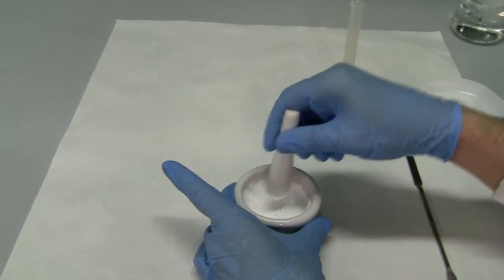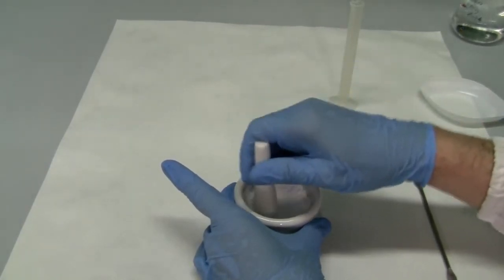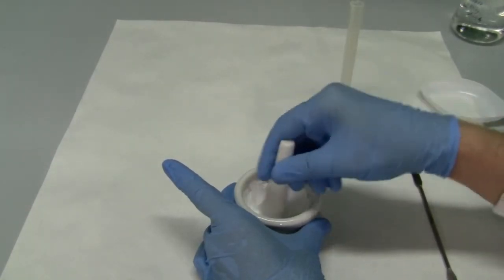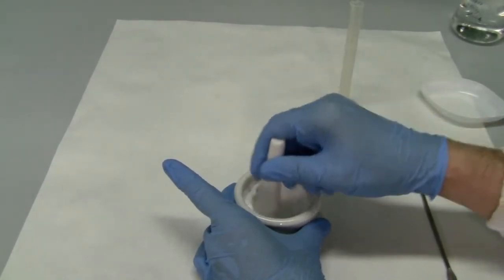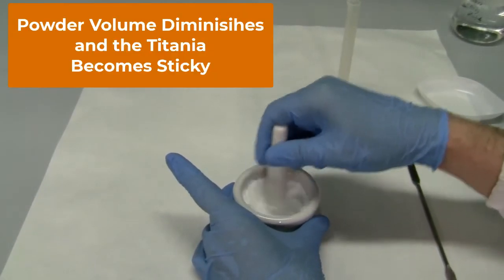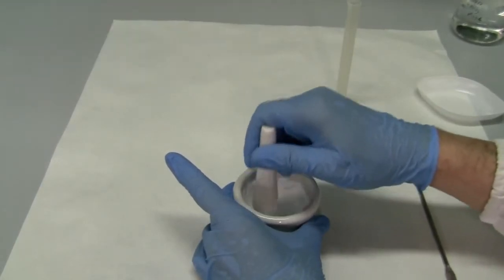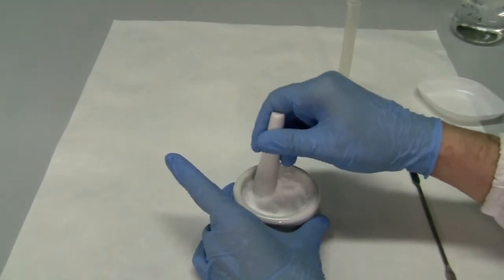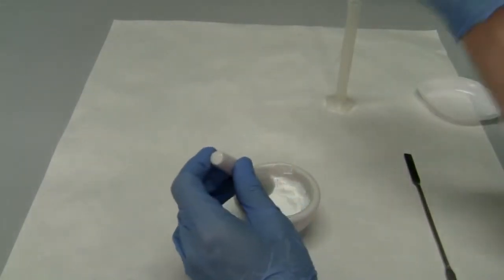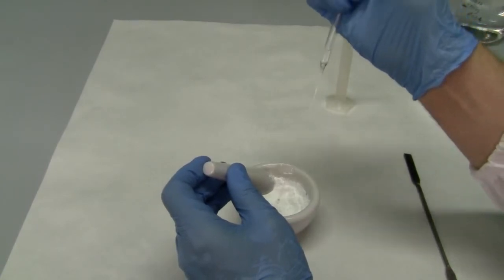We can see after a few minutes that the volume of the titania is diminished, and we can also appreciate that the consistency of this material is some sticking material that will become more and more viscous, after it will reduce its viscosity at the end of the procedure, giving more or less the consistency of a cream for hands.